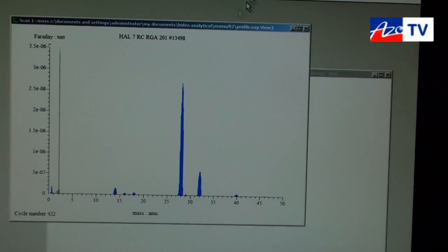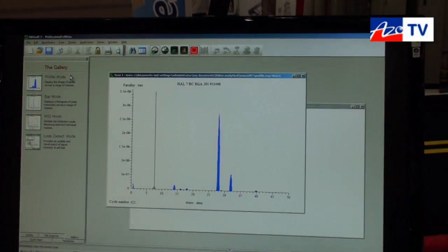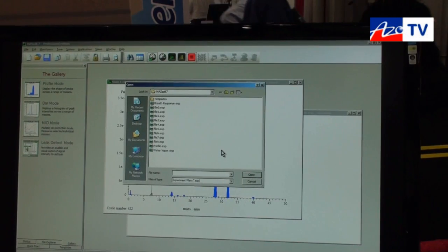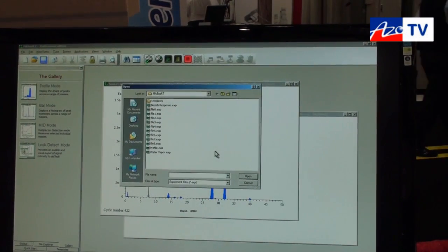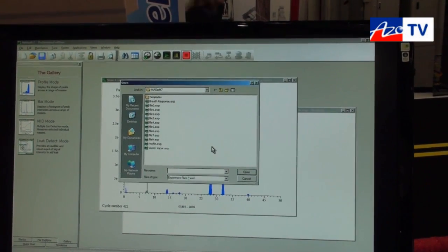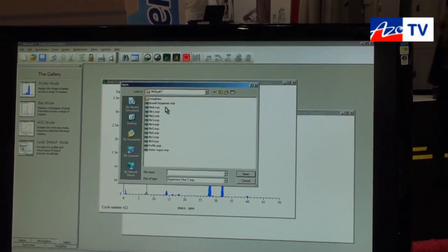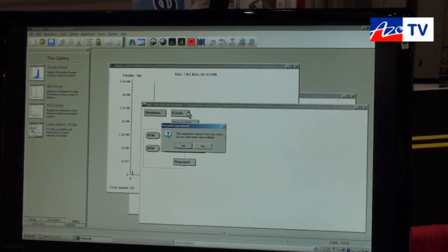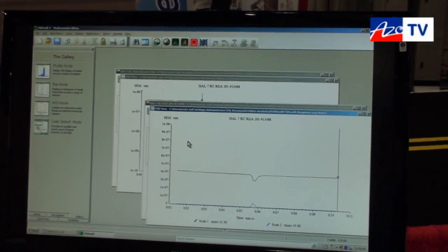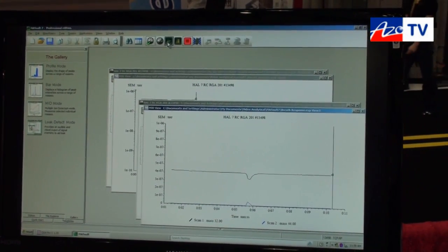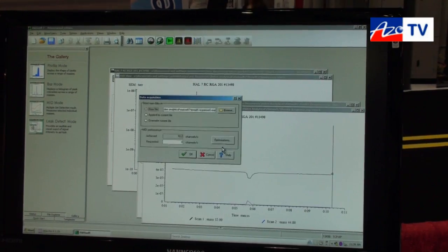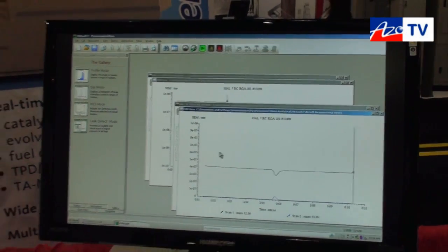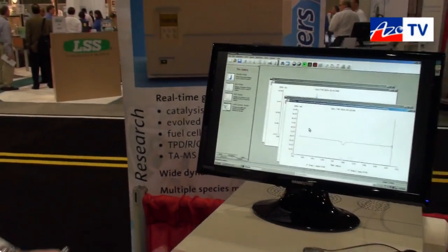If I just take a moment to stop this scan — one of the most common modes of operation is to look at discrete gases that the user has specified for their specific application. I've set up a little experiment that's going to look at oxygen and CO2, and we're going to run this experiment directly here so you'll be able to see the unique high-speed response of the gas analysis system.